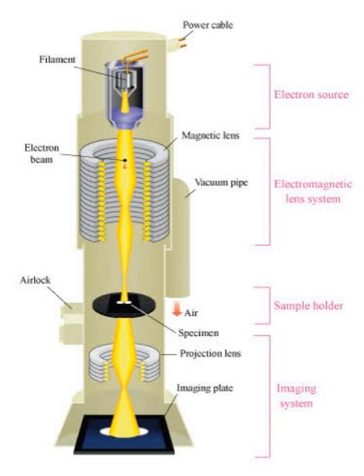The unstained specimen is then surrounded by a film of electron dense stain. By this procedure, the specimen appears light against a stained dark background.